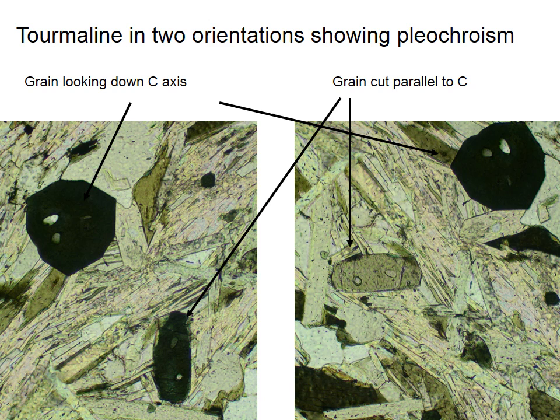So just a final example. Tourmaline is a great example of a uniaxial mineral with strong pleochroism, particularly dark tourmaline. The dark round grain on the left is oriented with the C-axis vertical. So on the right, when it's been rotated 90 degrees, it's still dark. And this is in plain polarized light. You can confirm in cross-polarized light that it is black, so the C-axis is vertical.